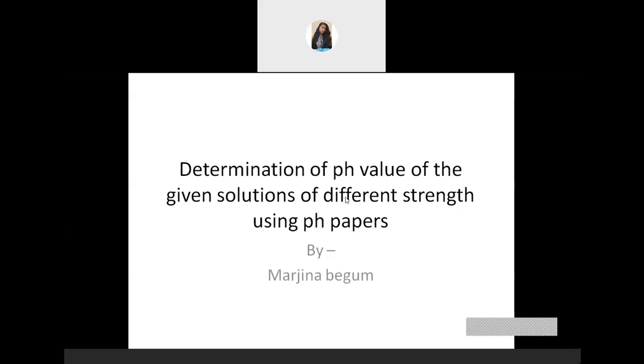Okay, everyone, I'm starting the class. I will discuss the determination of pH value of the given solution of different strength using pH paper.